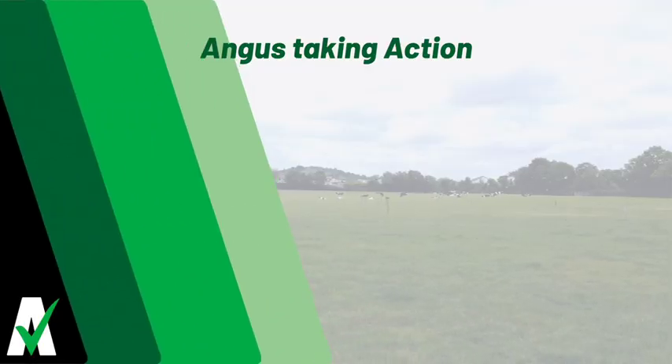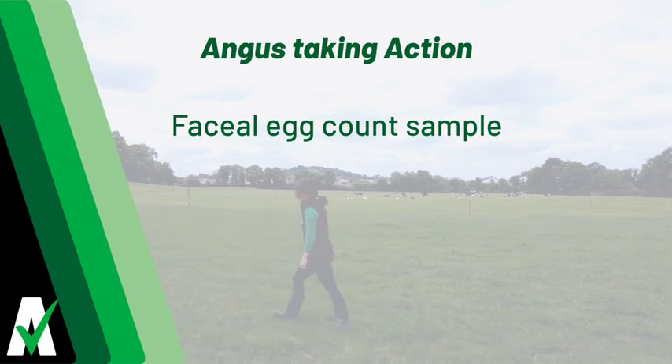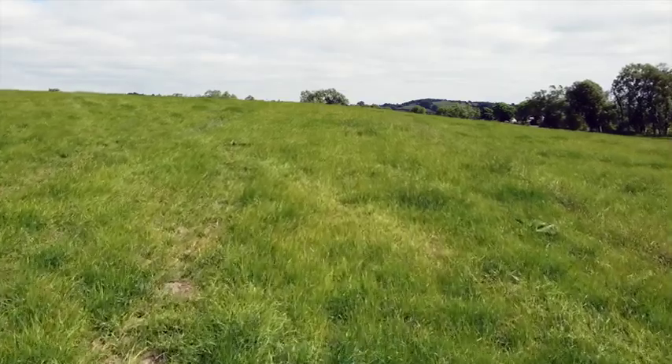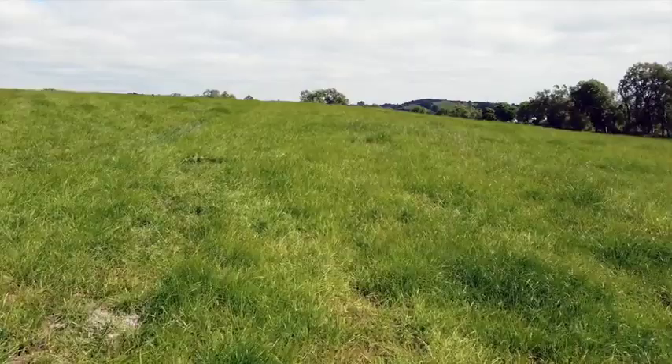Hi, I'm Catherine from Certified Irish Angus. In today's video, we'll be taking you through how to take a faecal egg count sample. Faecal egg count sampling is assessing the number of worm eggs passed per gram of faeces.